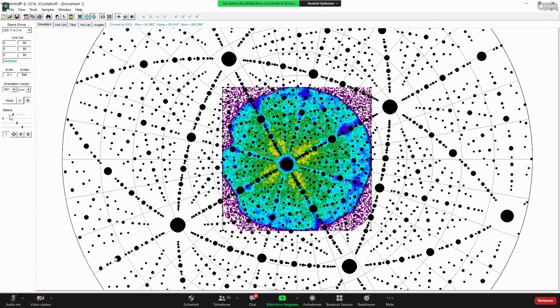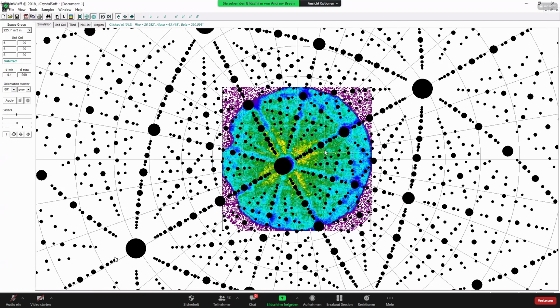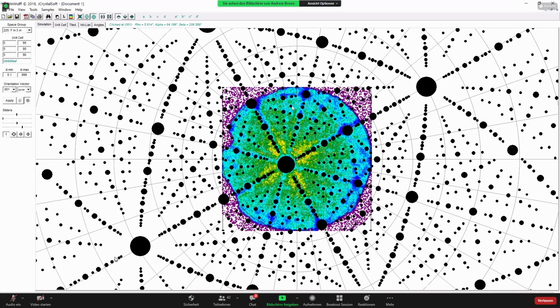And I'm going to zoom in a bit further. Our angular field of view on this is actually pretty small. It's more like 50 degrees, but that's probably because of overfilled, or possibly this was even on a really old detector on the 3000 where the field of view was even a little bit small. But if you're using a modern 4000, 5000, you have an overfilled detector, it's probably about 3 to 4 of those circles across, so 67 degrees.